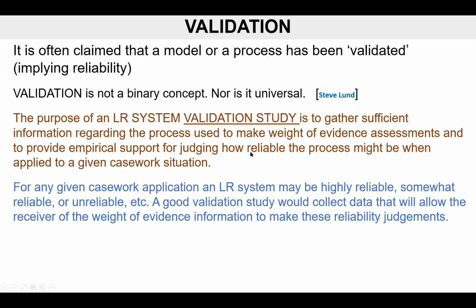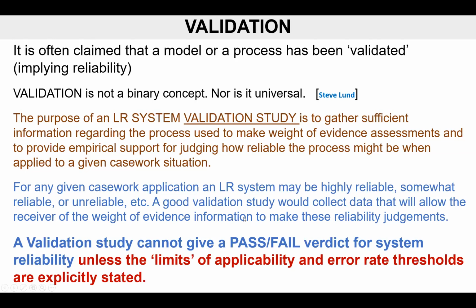So for any given casework application, an LR system may be very reliable, somewhat reliable, or unreliable. A good validation study would collect data that can inform the trier of fact or decision makers regarding reliability pertaining to that case. So bottom line is, a validation study cannot give a pass-fail verdict for system reliability unless the limits of applicability and the error rate thresholds or reliability threshold is explicitly stated.